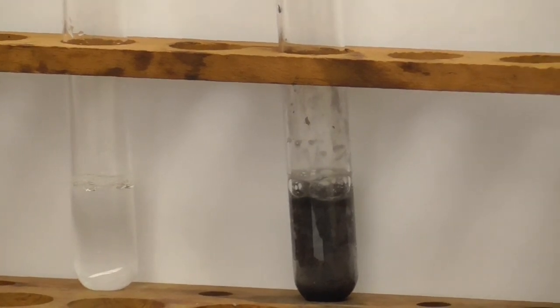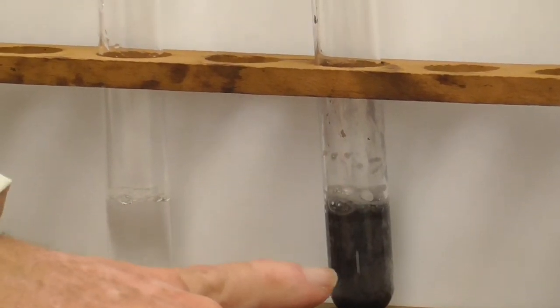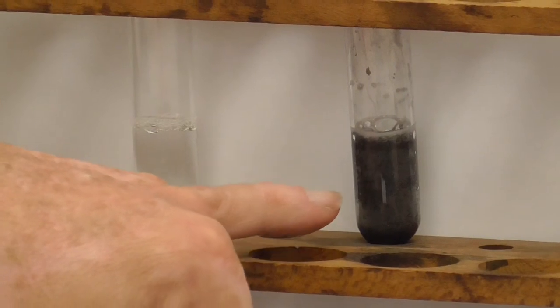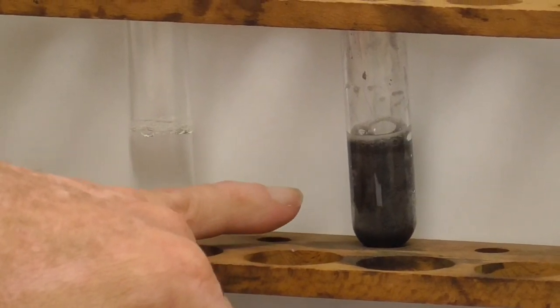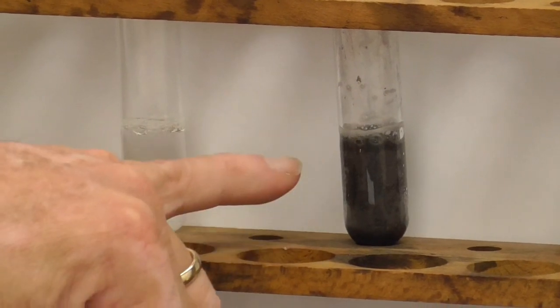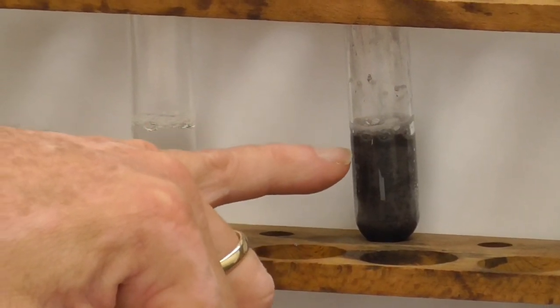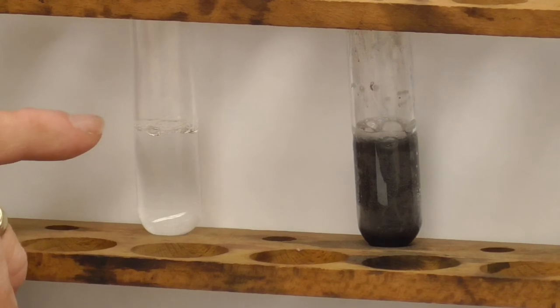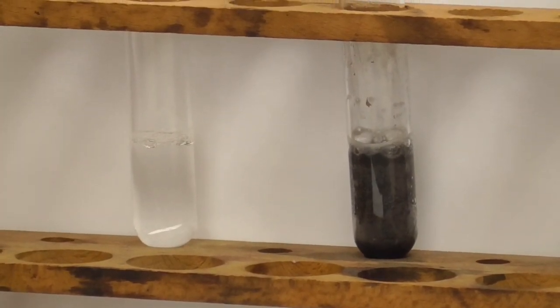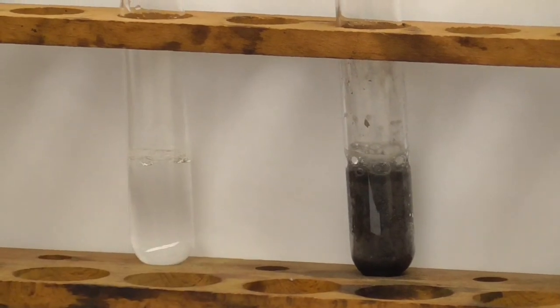One thing that hopefully you'll notice is that the black powder is still there. Yeah, it's kind of mixed up because it's being bubbled up and so it's swirled up, but it's still black, it's still powder, it's still present. So the catalyst is not being used up, it is not part of the reaction. But quite clearly, we get all this gas being produced very quickly compared to this one where, yeah, I haven't even seen a bubble yet. And so it's really speeding up the reaction very much without being used up itself.